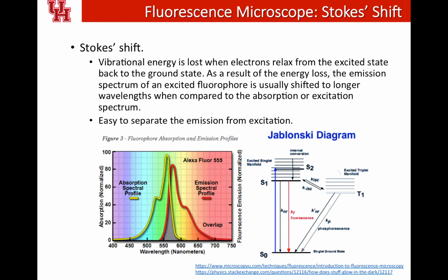That's a good thing, because it makes it easy to separate the emission from the excitation. If they were at the same wavelength, you could not separate these two signals. So you have to separate them. Otherwise, the excitation is so strong, it will kill your emission signal.